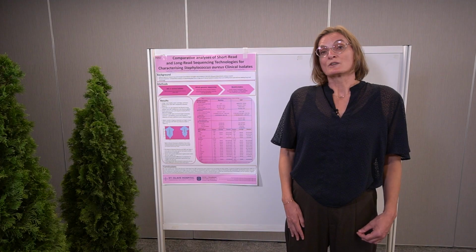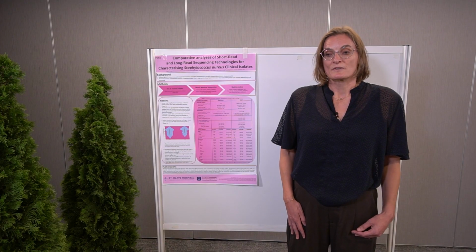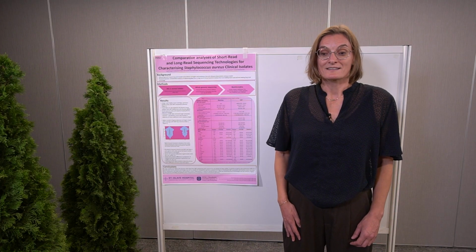So I guess the take-home message is that it's important to really understand and know the strengths and weaknesses of the sequencing technology one wants to use for one's research project to make sure that it can answer the research question one has. And also to know that the differences between short and long read goes beyond base quality and contig length. And perhaps if one wants to do a more comprehensive genetic analysis, a combination of the two technologies may be a better solution.